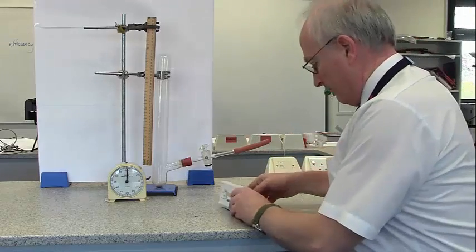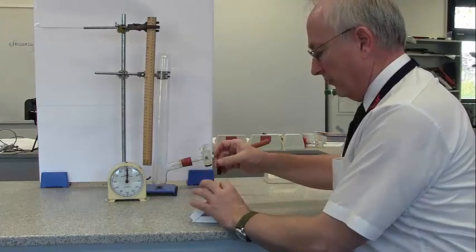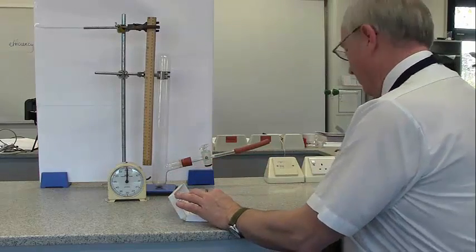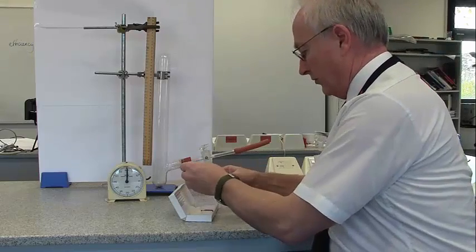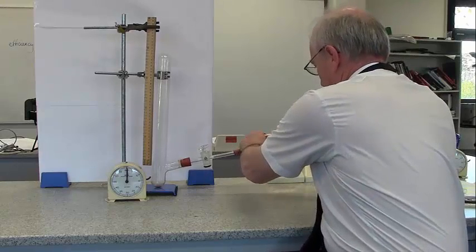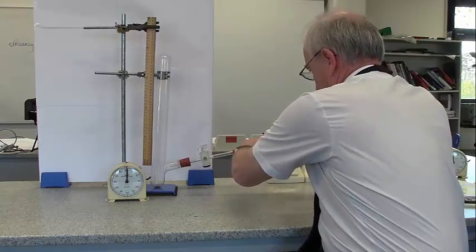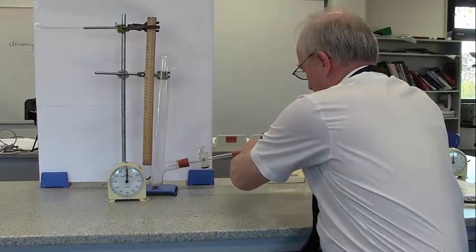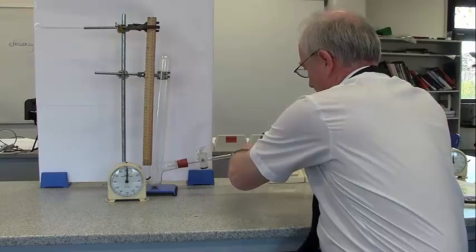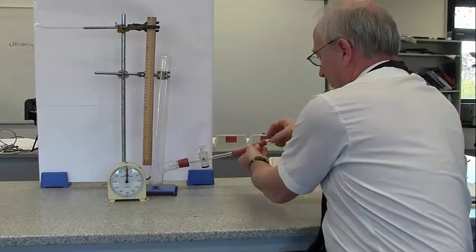The bromine comes in these capsules, which have a liquid. It's a liquid, but it's under a little bit of pressure. I'm going to put the capsule into a glass container, and I put the container on the end of this rubber tubing. Bromine is a corrosive liquid, and I don't want to be breathing it in, so it's sealed. I've got a rubber tubing here.